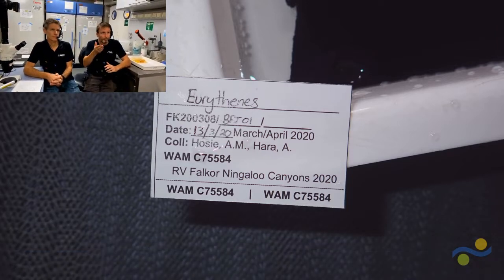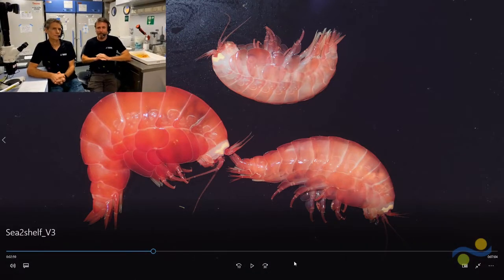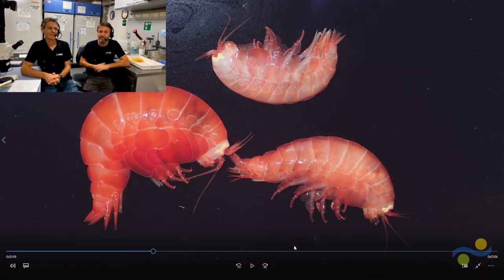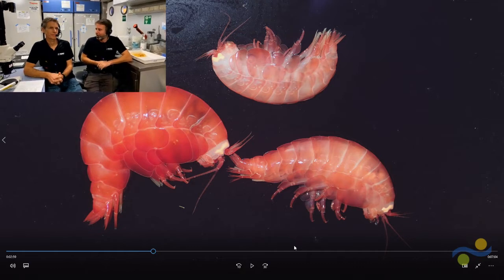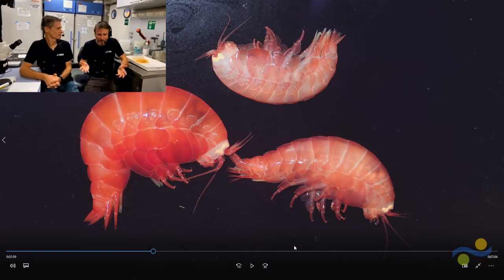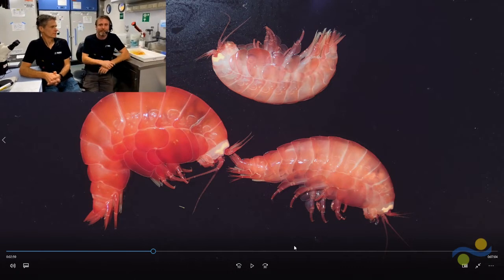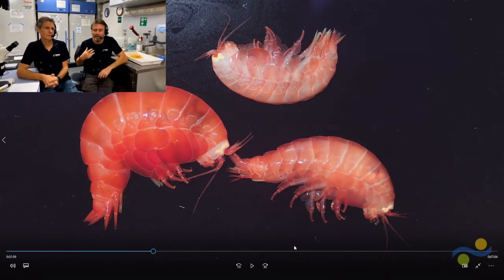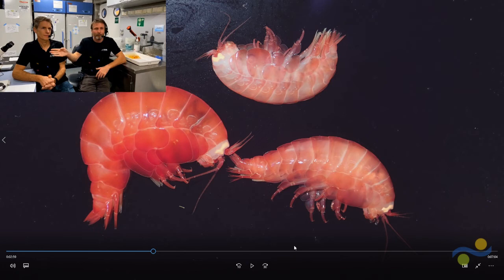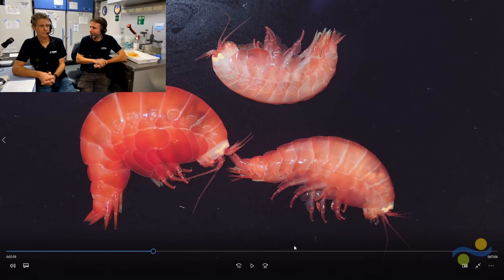So we keep track of where it was collected on the label as well. We give it a field identification. We never hang our hats on getting everything right in the field. There's plenty of things we certainly have not seen before in this trip. We don't have access to all of our normal kit that we would have in the office, so some things are likely to be a little bit off, which is the best guesses that we can get for here, and we'll have to bring them back to the lab, and that's where the real long work on the microscopes, like we've got on the side here, is where we really get the names sorted out.